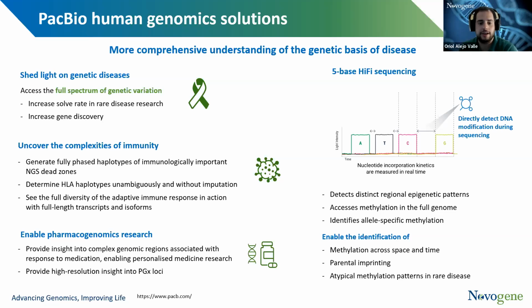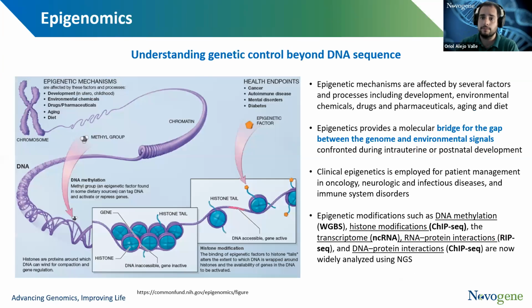Thanks, Larissa. It was indeed really clear. Following with PacBio, we have another question from Ramin, who says that, to clarify, when you mentioned high accuracy and high error rate when talking about PacBio, and another question he had is whether, if the PacBio continuous long read mode, the CLR setting, is inaccurate with high errors and long reads, would it be advisable to use Oxford Nanopore instead?